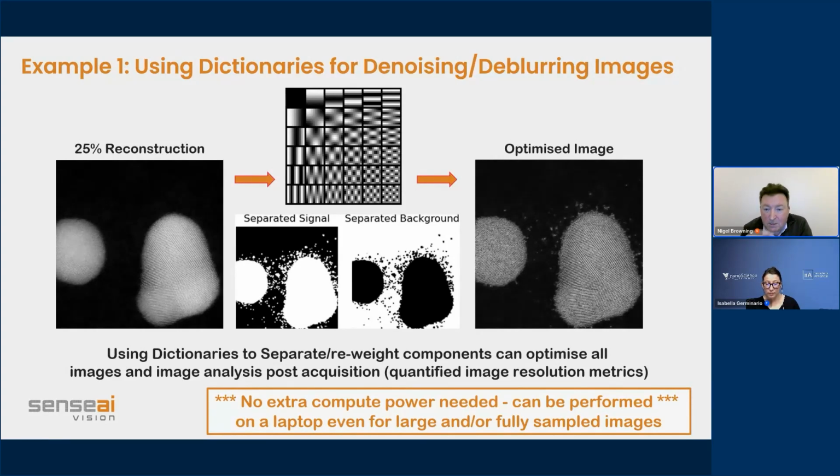And the important thing on this image here is that you can see that the big gold nanoparticles are much better resolved in terms of the atomic structure. You can even resolve those blurry bits that didn't come through in the compressive sensing live reconstruction. But also, very importantly, you can see all of the individual atoms that are sitting in between these two nanoparticles. And you can even see that some of them are moving around because they've come across as being slightly distorted in the way that they're going through. So we can resolve all of these images having got to that best condition.